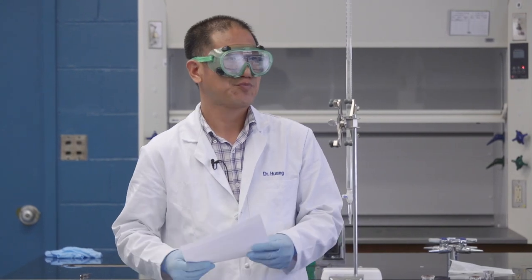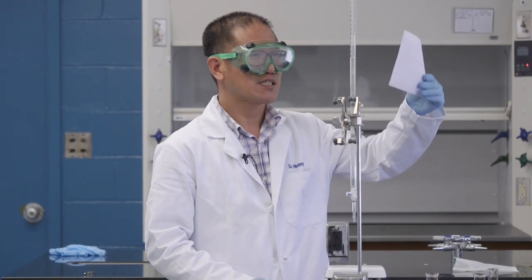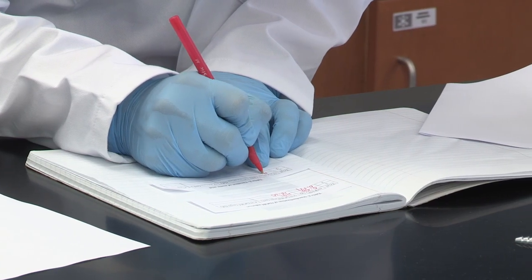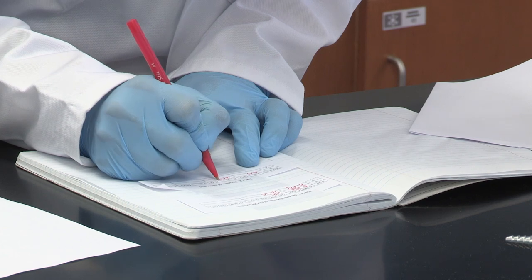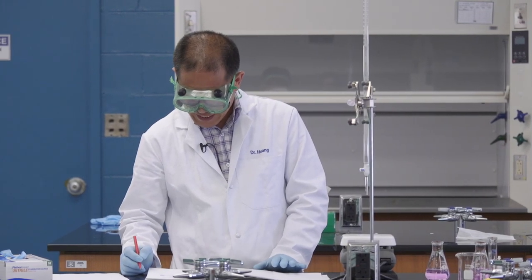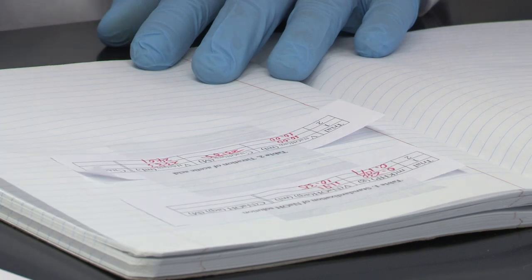Let's take a look at how much solution we used for this titration for the unknown. We may need to use a white paper to help us visualize the bottom of the meniscus. This time, we have used 22.83 milliliters. Let's record the data immediately. 22.83. The second time for the titration of the unknown acetic acid, the volume we use is 24.01 milliliters.